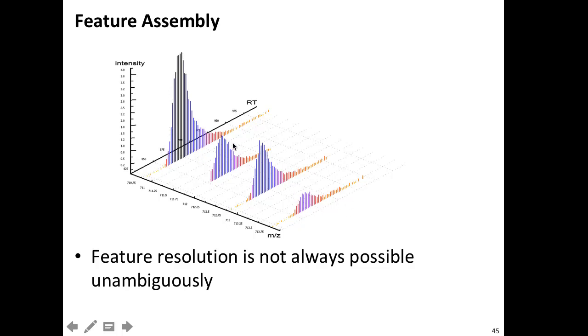They're all co-eluting. The only thing that is funny is this second guy here, because from the distribution, you would expect that the +1 peak is higher. This guy should be higher than this guy, but it's the other way around. What is going on?